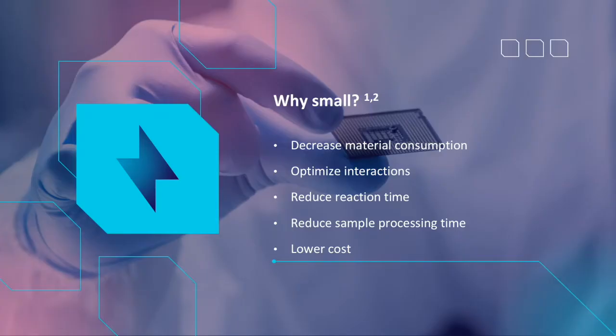So why should we care that our microfluidic devices are small in size? Obviously, for the numerous advantages the small scale would provide them with, such as decreased material consumption, optimized interactions, reduction in the reaction time, reduction in the sample processing time, and having an overall lower cost.